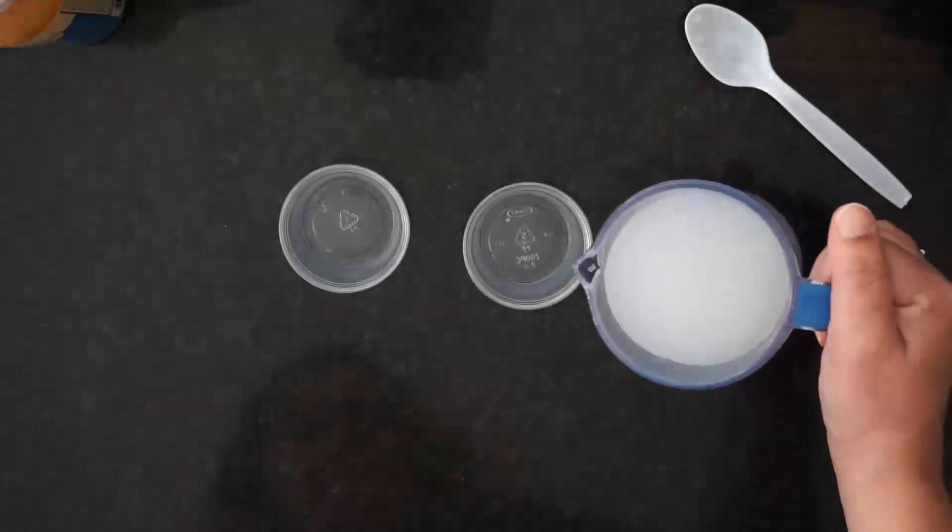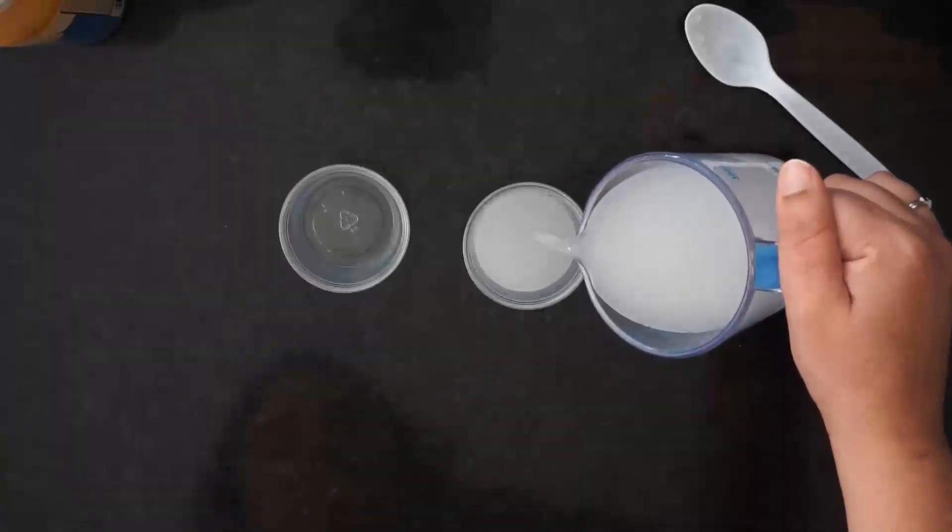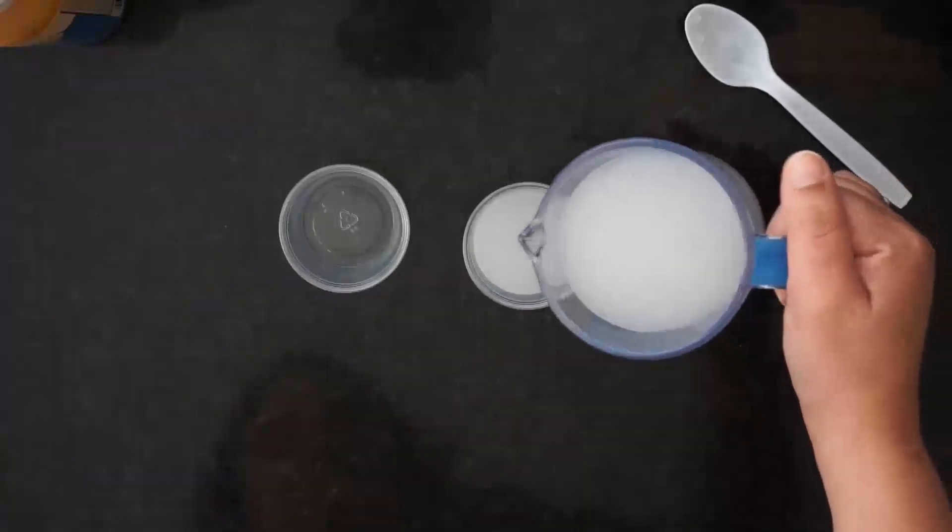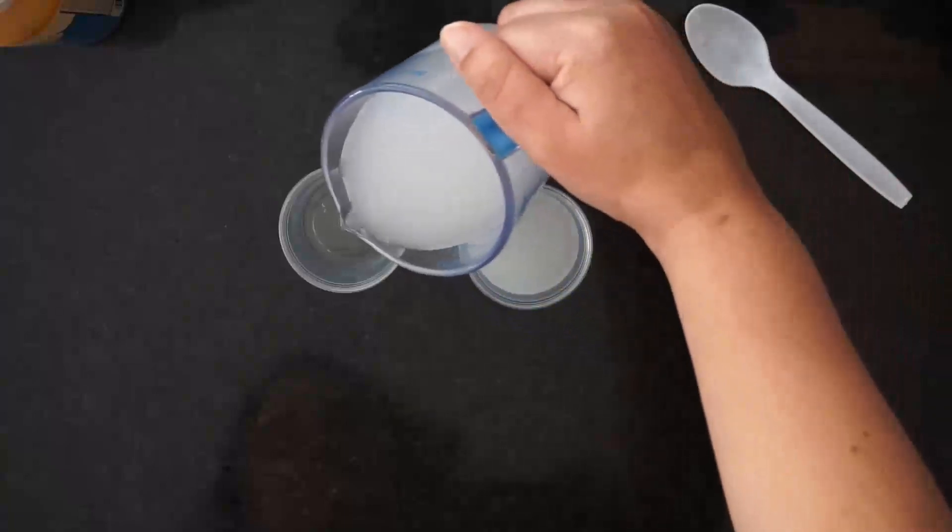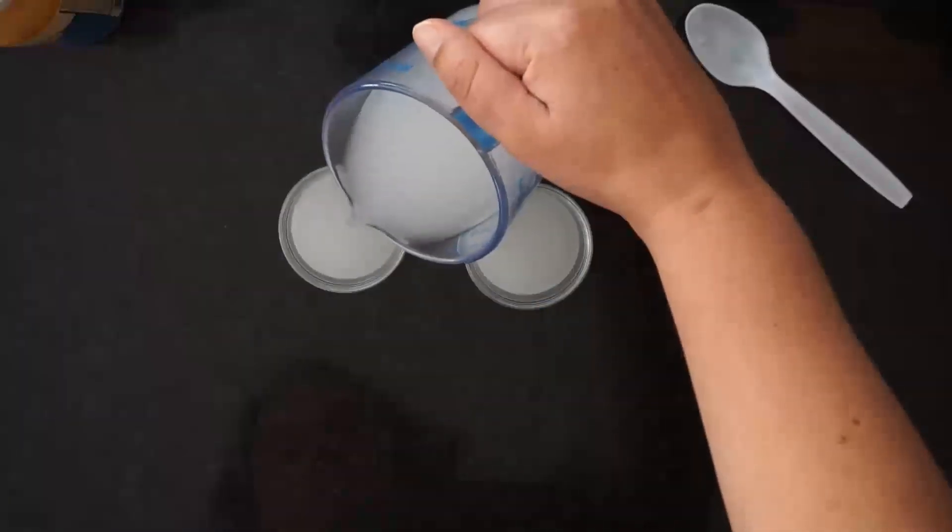Then pour a little less than a quarter of a cup, depending on what size your cups are, into both of your clear cups.